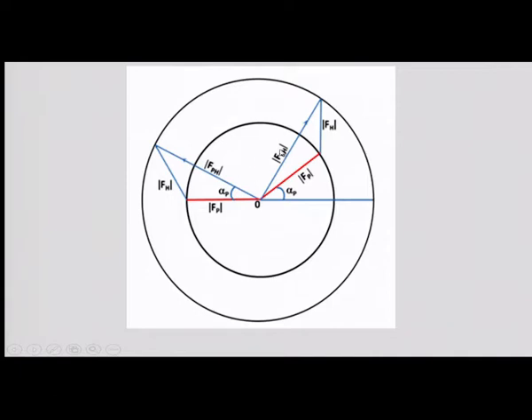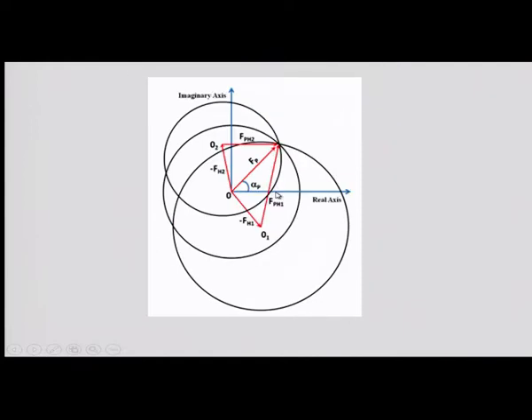This twofold ambiguity in the phases can be resolved if you have one more derivative. Let us see how the Harker circles go. The first has O as center, and these are all moduli only, so do not confuse. With mod F_P as radius, I draw a circle; this is the red one.